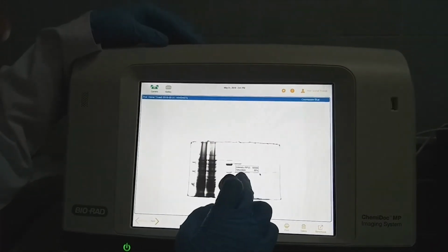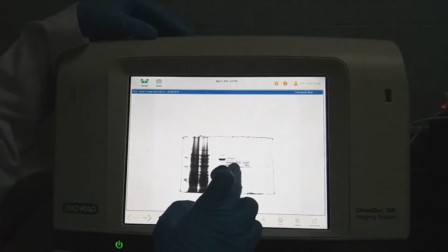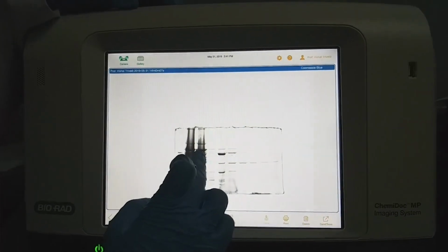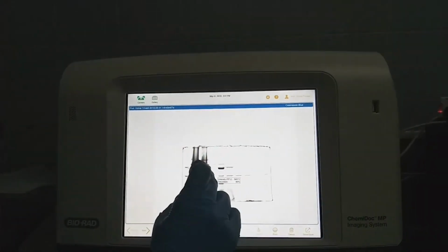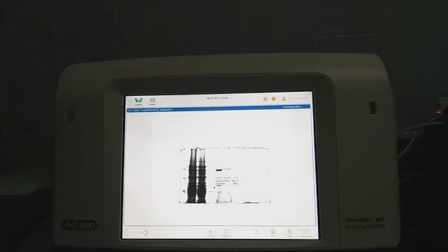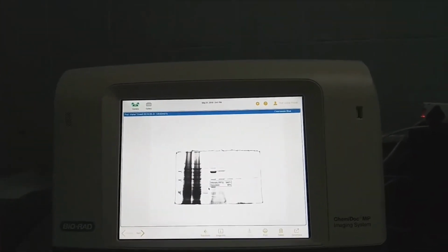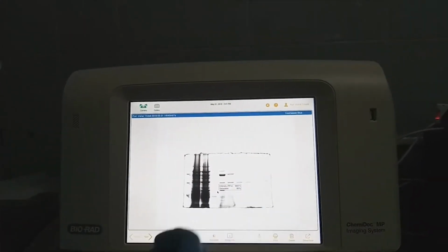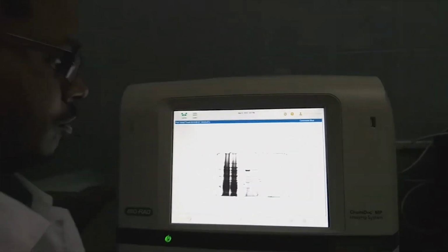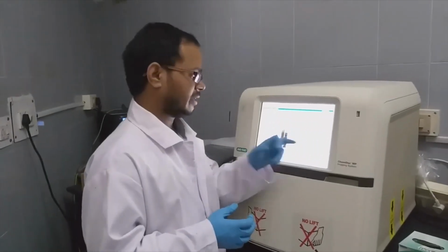As we can see, for the protein corresponding to this purification, the His-tagged one, most of the fraction is going in the flow through. So, as I said in the video earlier, we can use this flow through again for purification of the protein. You can incubate this flow through with the same beads, and you can repurify again. That will increase the productivity of getting the protein.